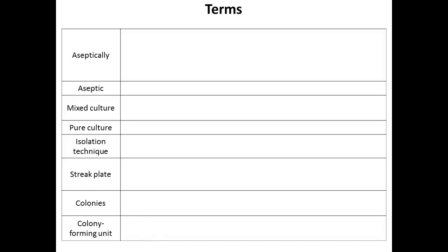So, aseptically, what does that mean? Without contaminating. Because we already know from our very first lab, are there microorganisms in the air? Yes. On our desktop? Yes. Our hands? Yes. Breathing? Yes. Right? So we want to minimize that.